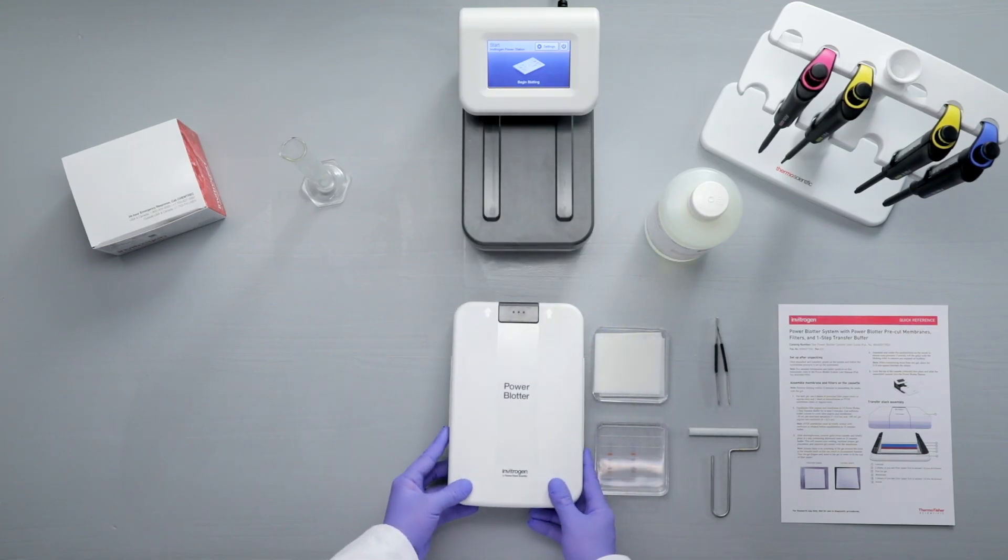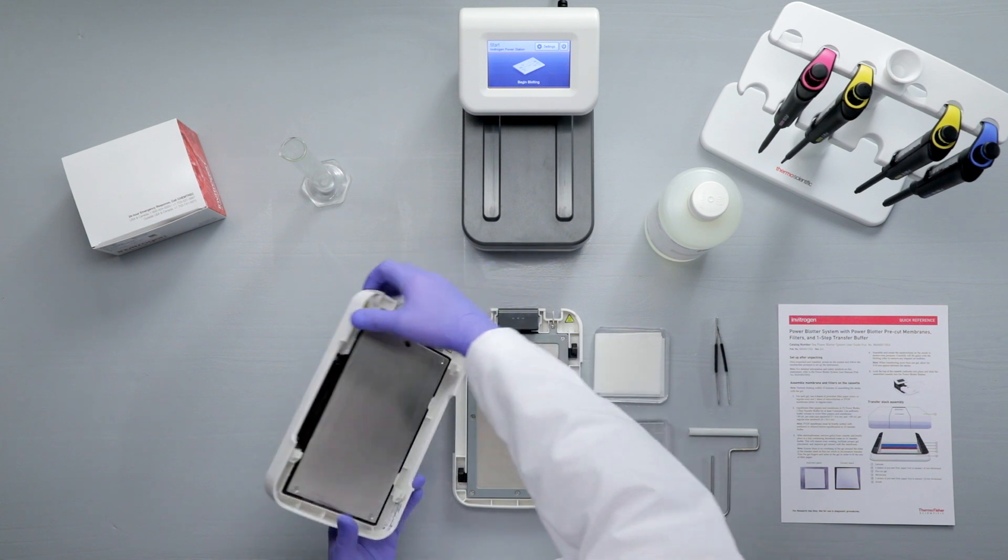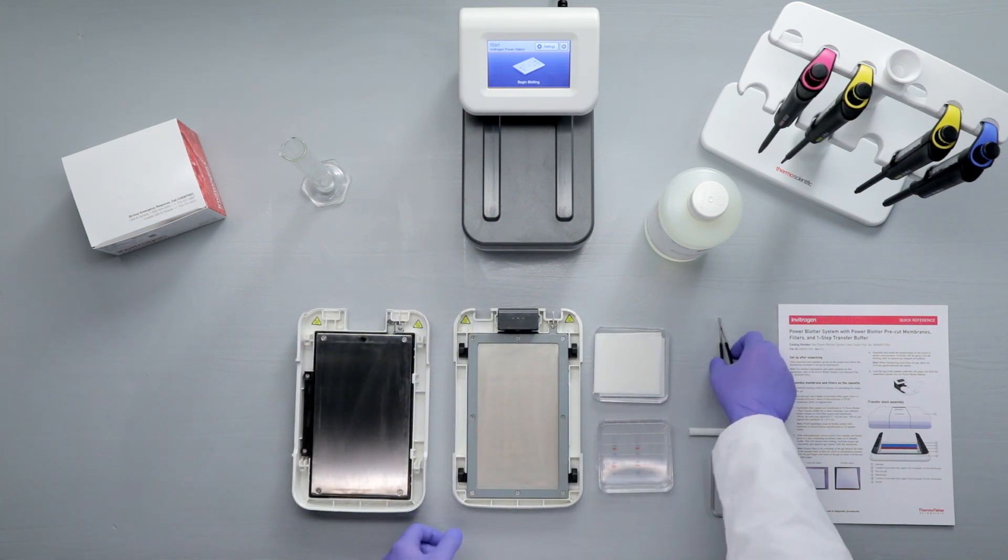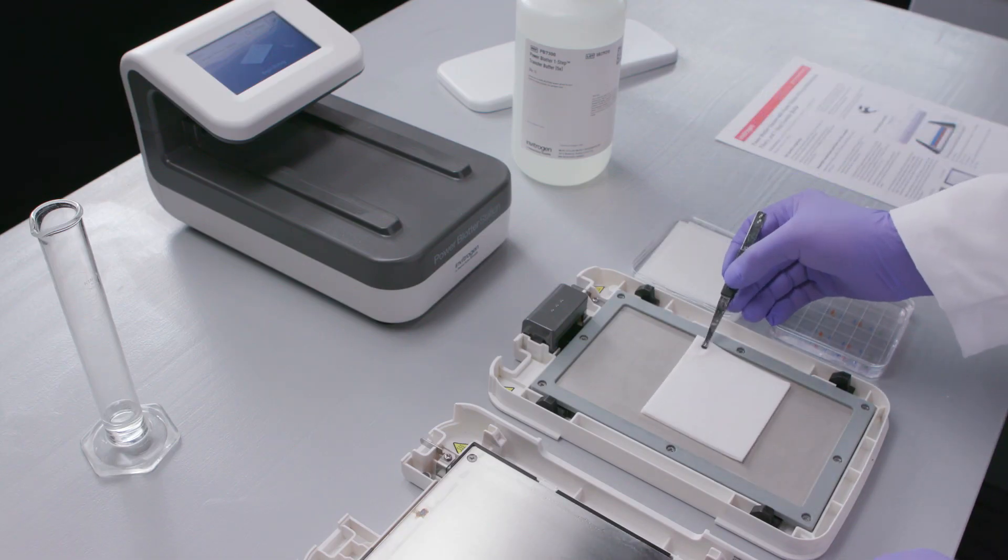Open the Power Blotter cassette by pressing the gray button on the lid. Remove two pieces of filter paper from the buffer and place them in the center of the bottom part of the cassette.